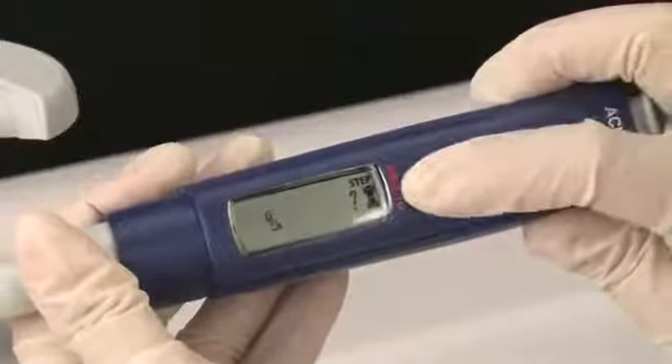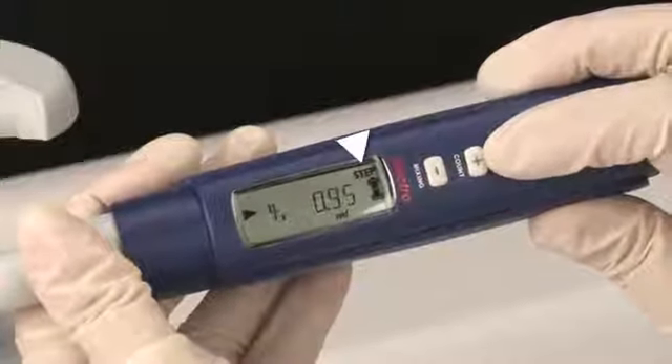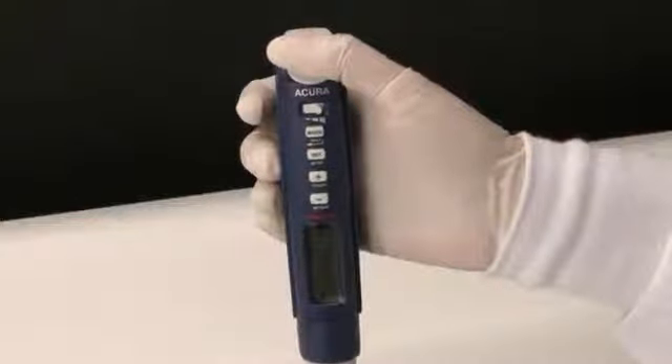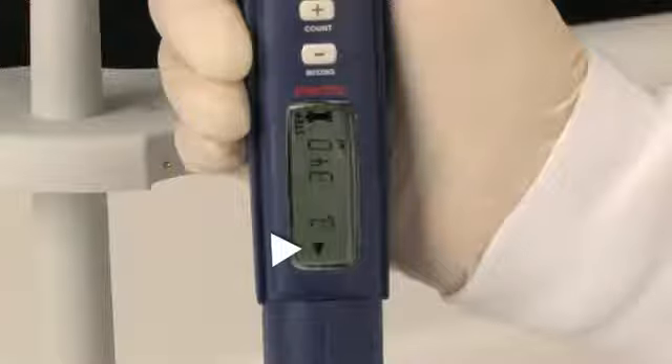The number of aliquots can also be selected using the plus and minus keys. The display now shows 'step', indicating the pipette is in stepper mode, along with the volume and number of aliquots selected. The triangle pointed toward the top indicates readiness to aspirate. Push the start button to begin aspiration.